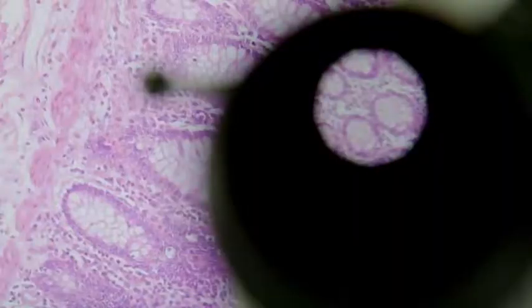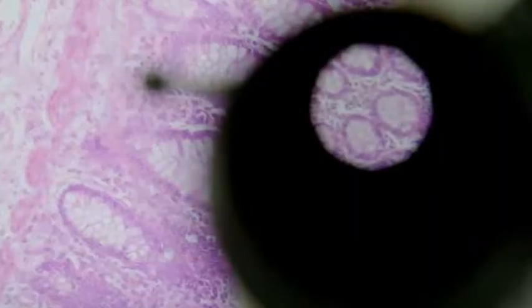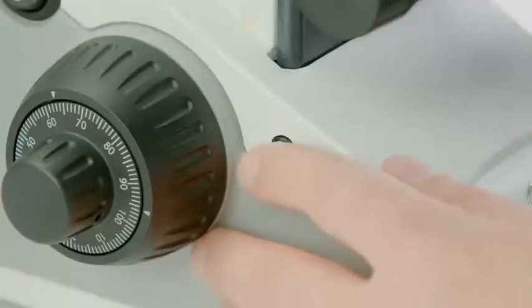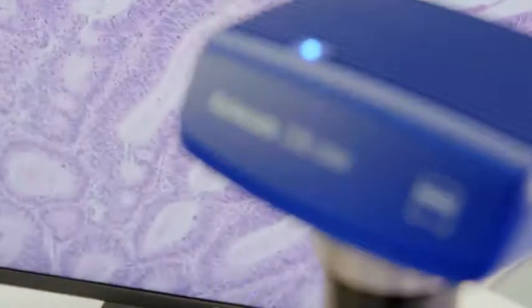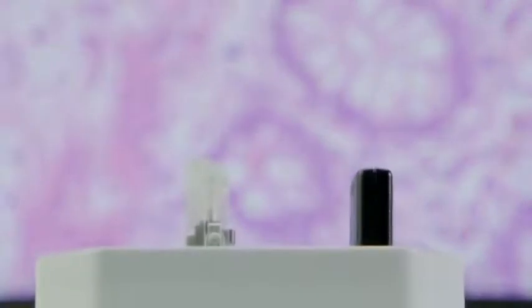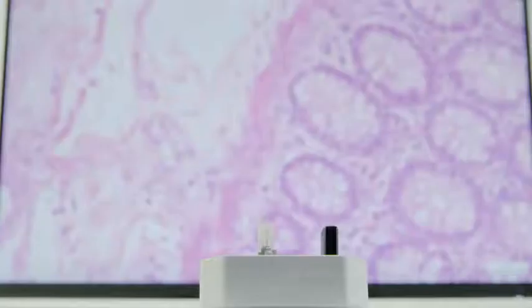The monitor and the eyepieces will show the same region of your sample with the same color impression. Press snap and there you have it. Your bright-field image as it appears through the eyepieces, including the right scale bar, is ready and waiting on your USB stick.